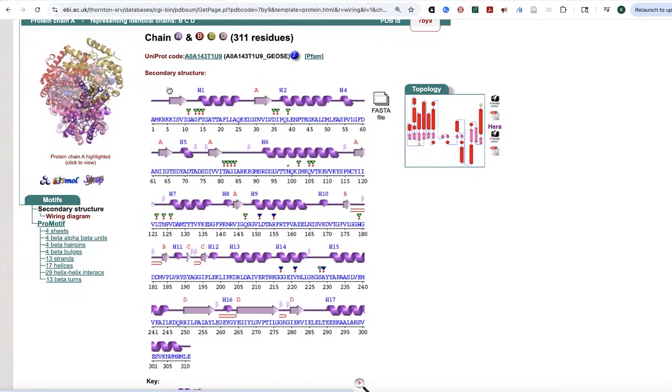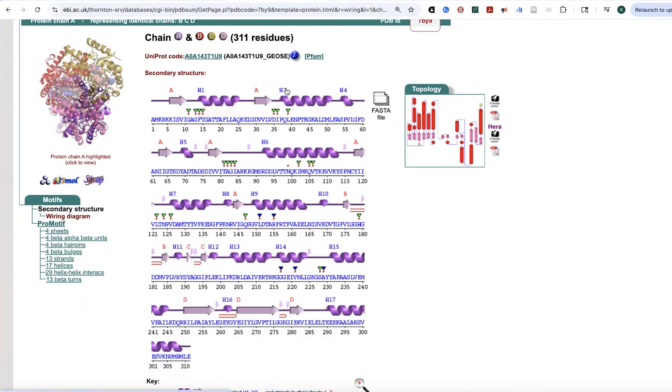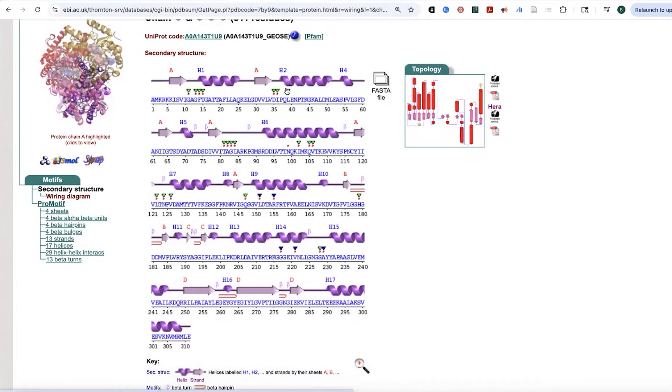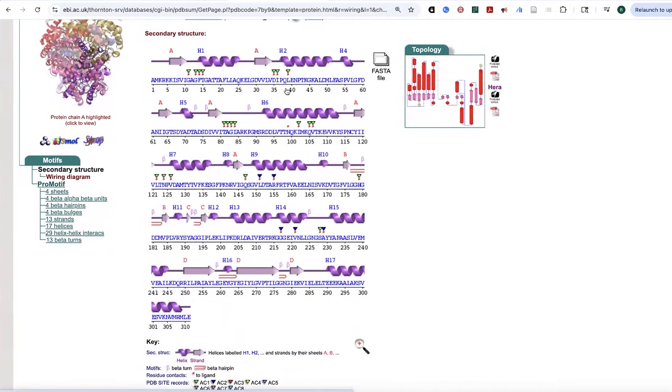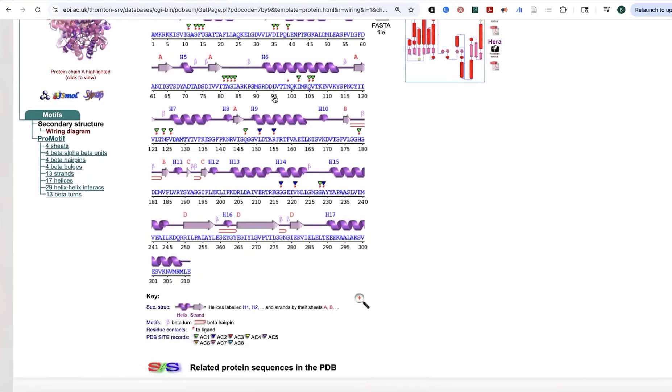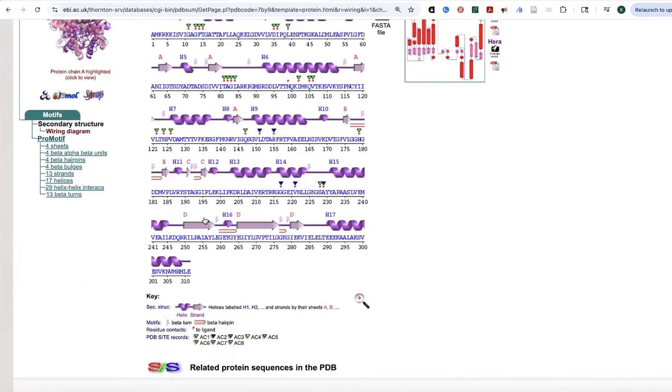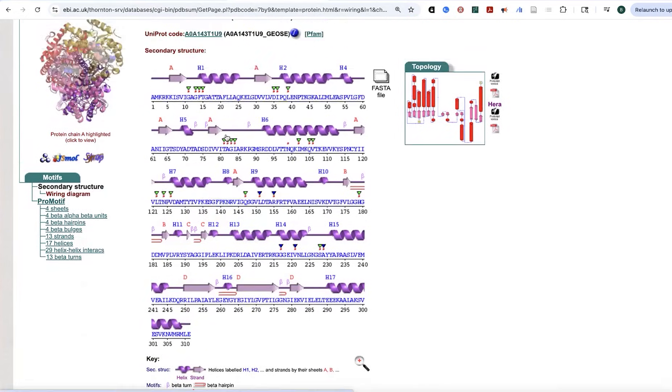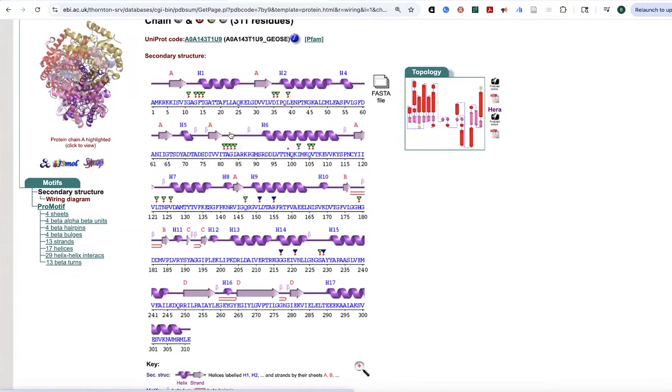Now it's actually going to be numbering them. And so you can see that we have H1, helix 1, H2, helix 2, etc. And we also see that we have these symbols for the beta hairpins, as well as these beta turns. So now we get a little more information. And it's also going to show us the interactions with those ligands.